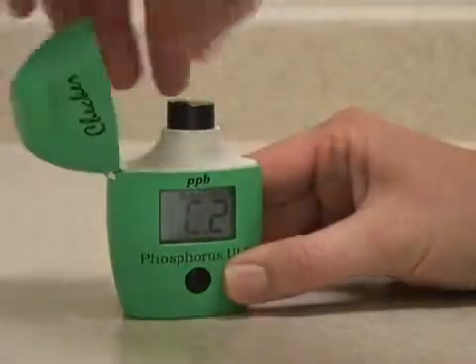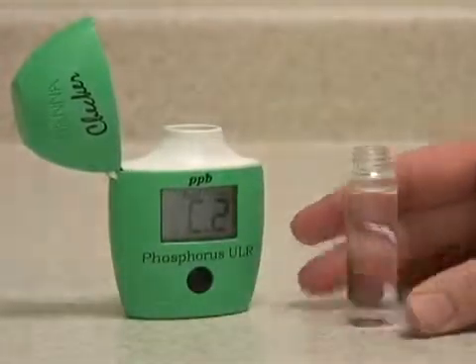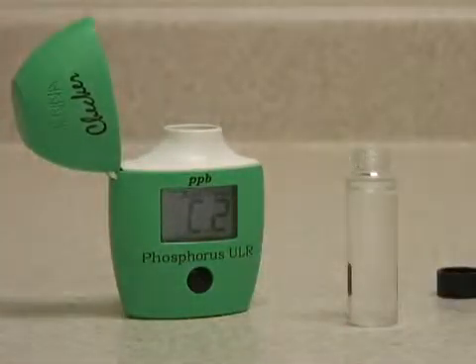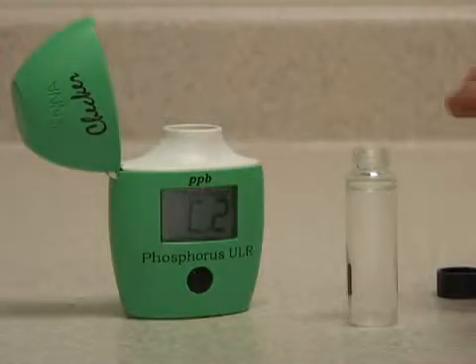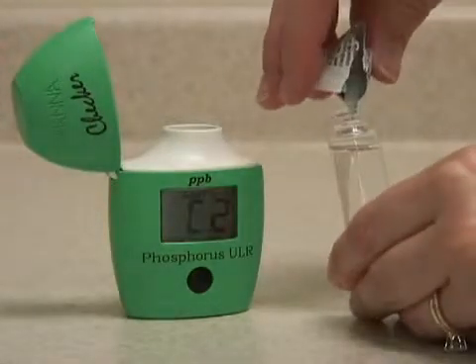When it says C2, take the vial out, remove the cap, pour in your reagent, and try and get as much of the reagent in as possible.